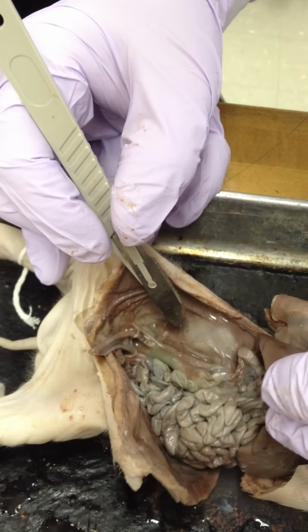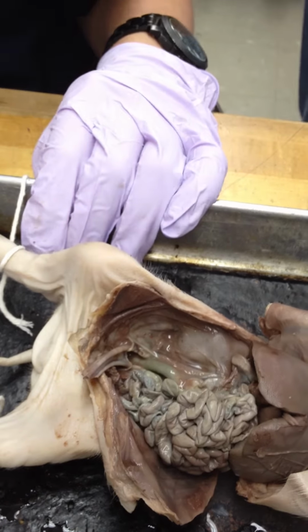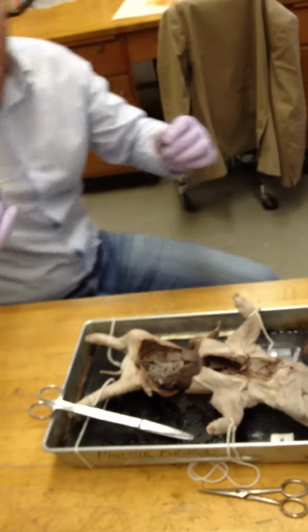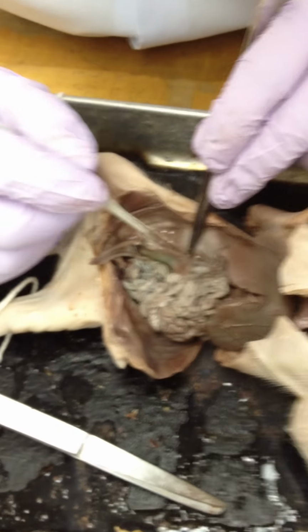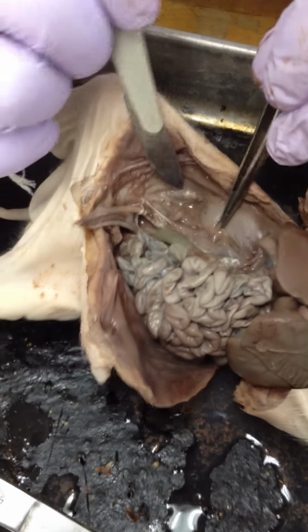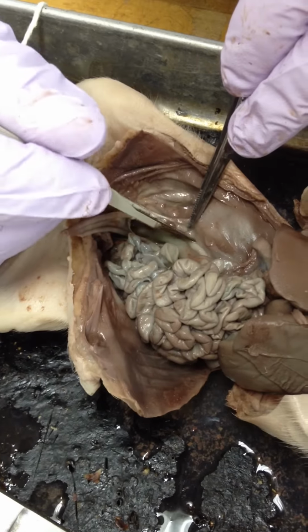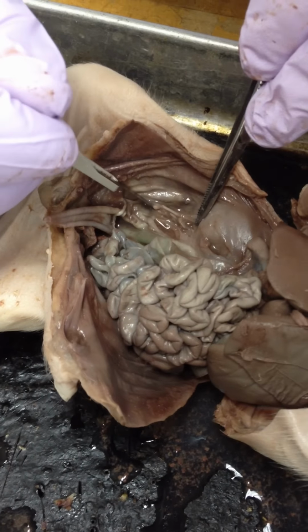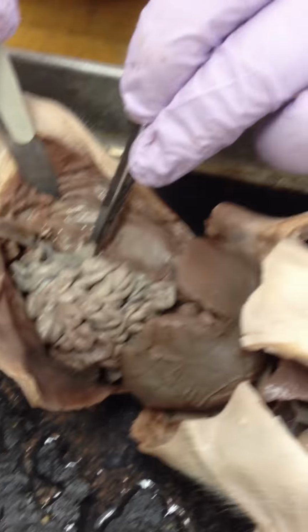I can see the large intestine there, and that's where it looks green because of all that bilirubin that gives the feces the appearance of green. It's just the dead byproduct of hemoglobin that turns into stercobilin.